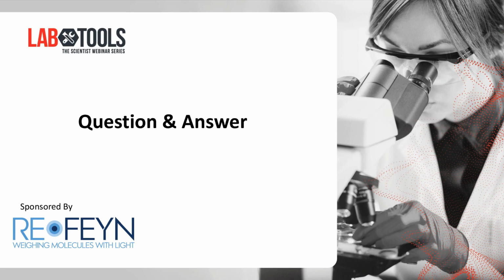There are some similar questions asking about whether you've looked at IgA or IgM binding, and if you can detect that. Short answer is we haven't. So all of the IgGs that we studied here were monoclonals. We don't see why other antibody formats like IgAs wouldn't work, but we haven't performed those measurements.